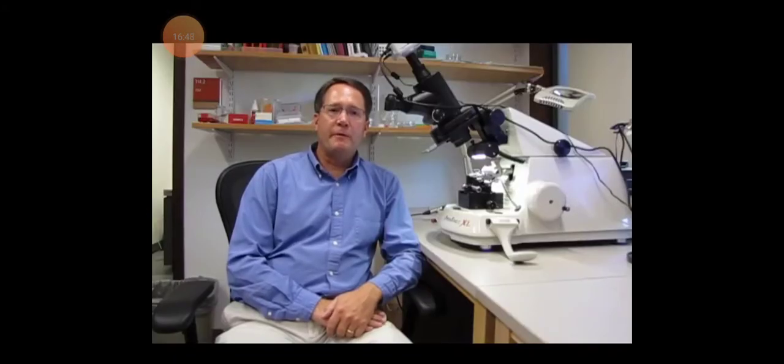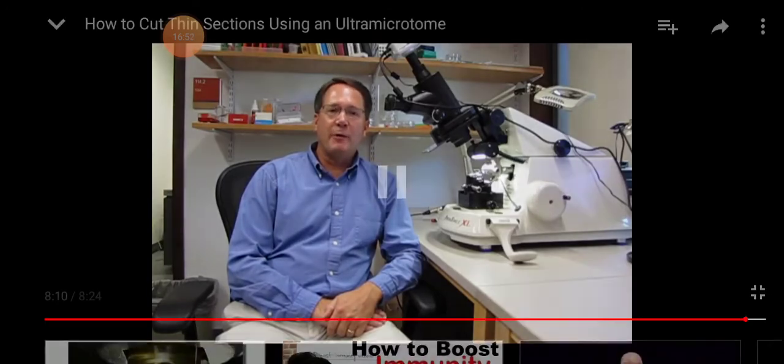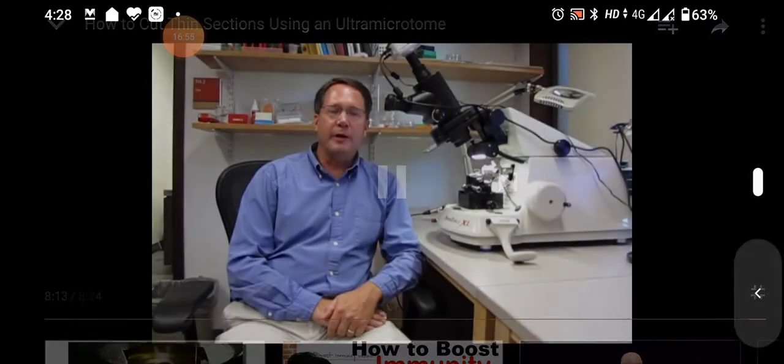So there you have it. We've cut thin sections safely without wrecking our sample. And now we're ready to pick up those thin sections and put them on a grid.